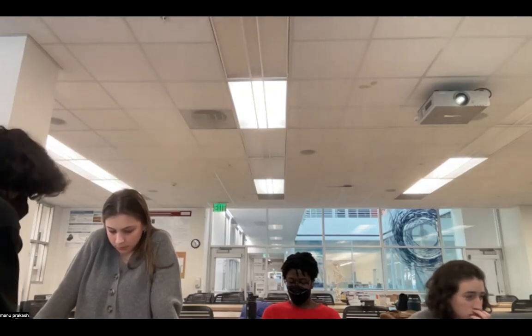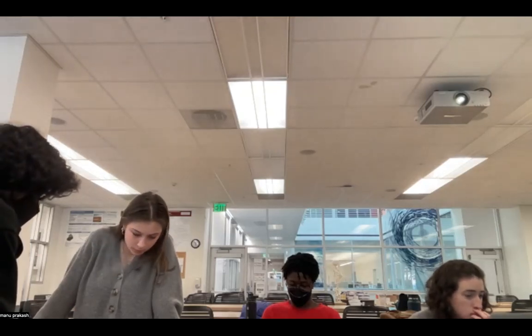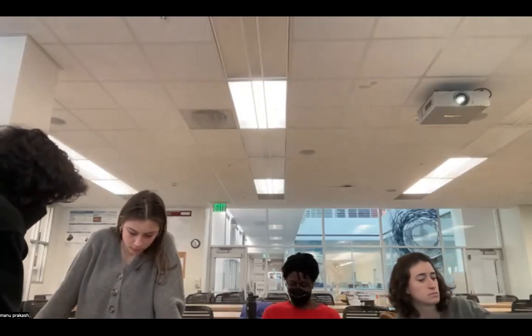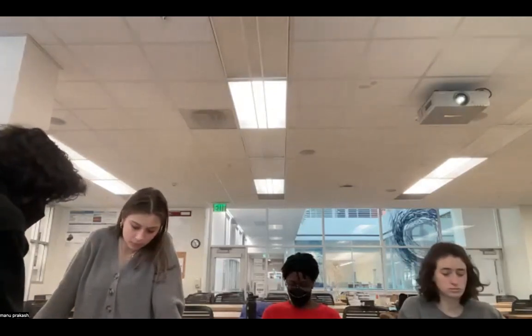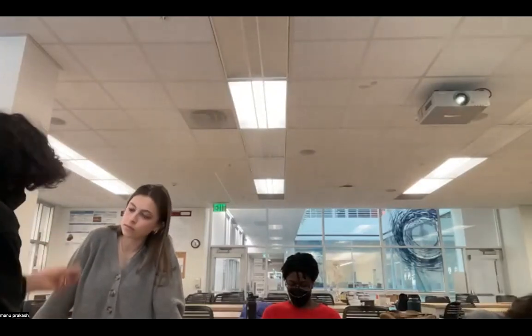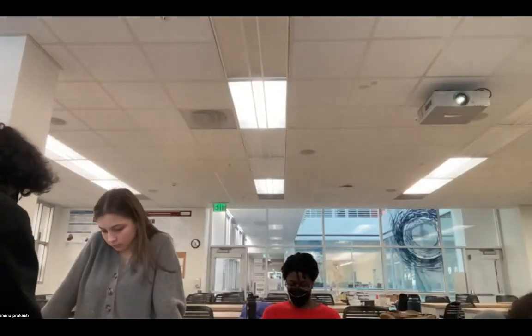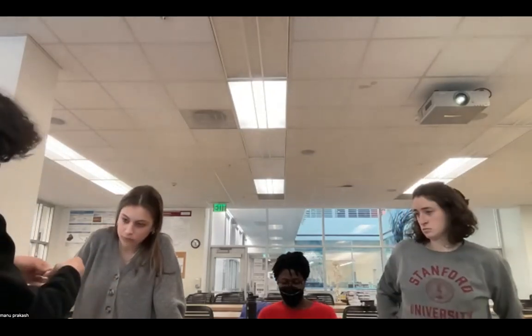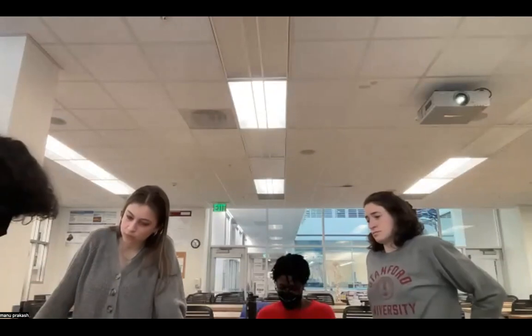And this is a seal, so what that does is it seals. You would only seal it after the sample has been loaded. Loaded and sealed. At this point, I'm assuming this would already have the sample.